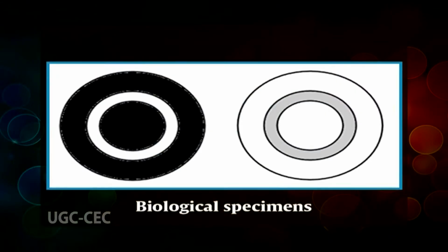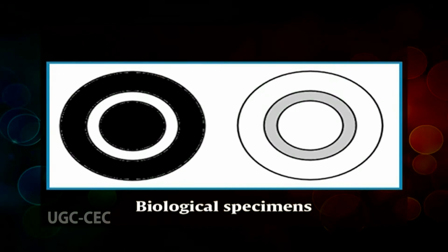Phase contrast objectives must be used which have a corresponding phase plate. Light rays passing through the specimen are slightly retarded, and further retardation takes place in the phase plate. When these rays combine with rays which have not taken this path, degrees of constructive and destructive interference occur, which produce the characteristic light and dark features in the image.